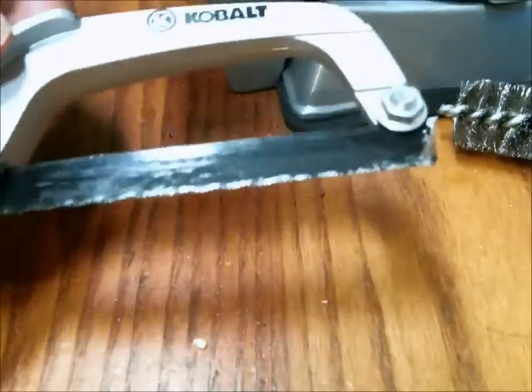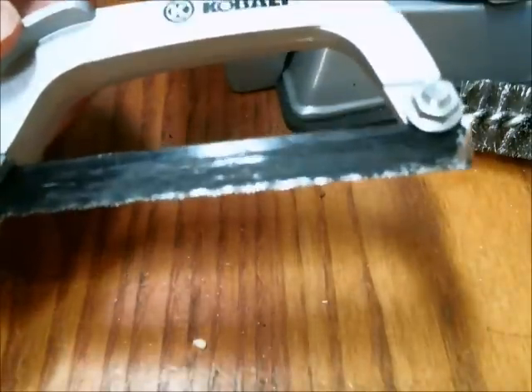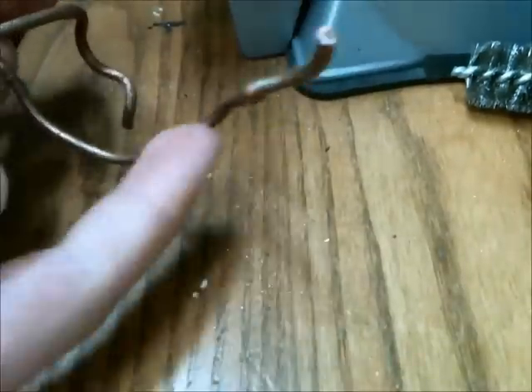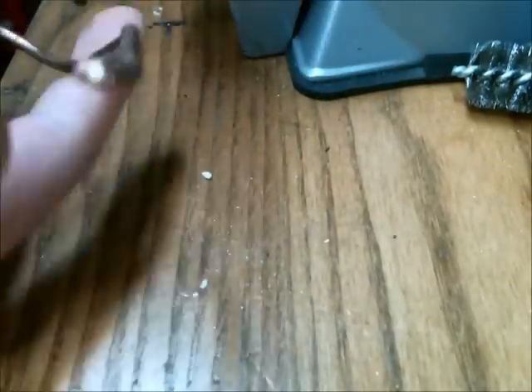I use this hacksaw to cut both the copper and the nickel. I just cut a small section off using the hacksaw — this is the nickel. And I cut a piece off of this copper wire here so I have a short rod that I can use.